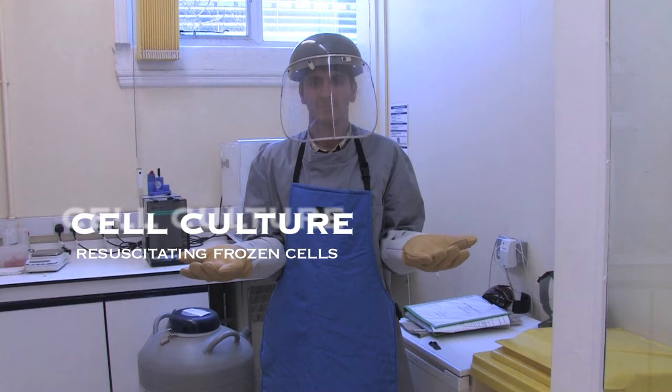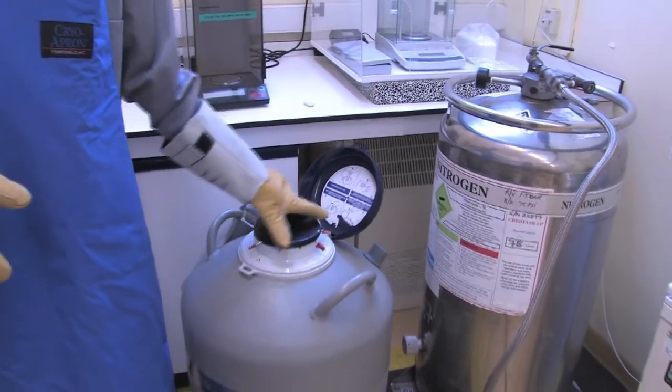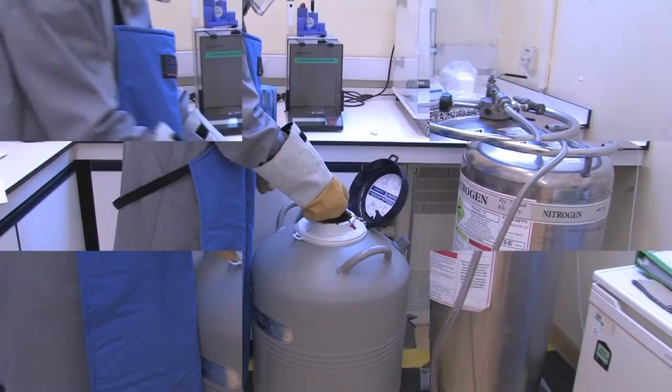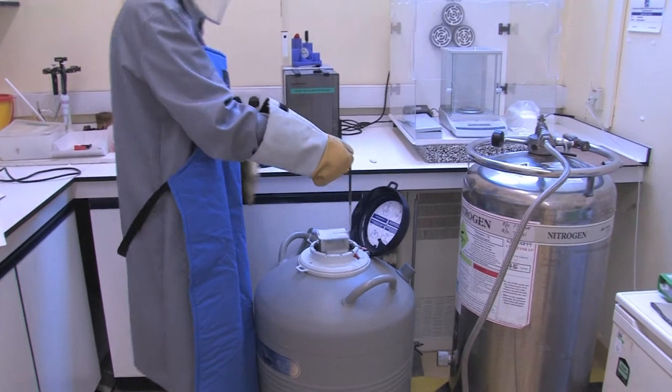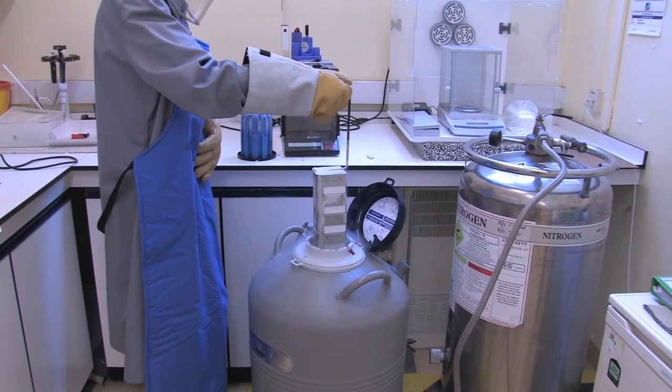Cell culture, resuscitating frozen cells. Firstly, the cells are removed safely from the liquid nitrogen. This must be done slowly in order to allow the excess liquid nitrogen to fall back into the dewar.